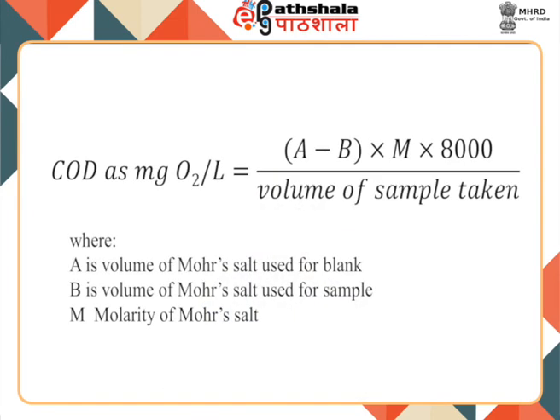From this equation, we will calculate the COD of the water sample, which is the volume of Mohr's salt used in the blank minus the volume of Mohr's salt used for the sample, multiplied by the molarity and divided by the volume of the sample taken.